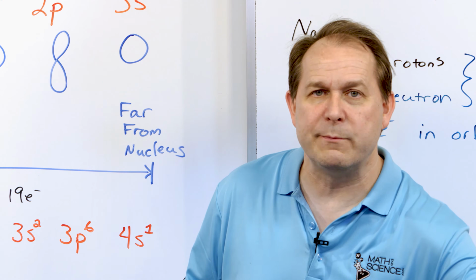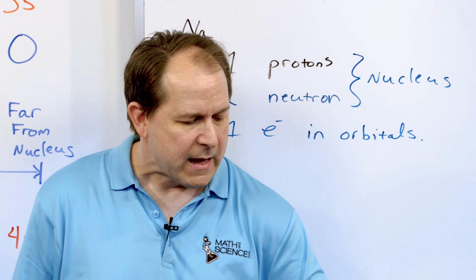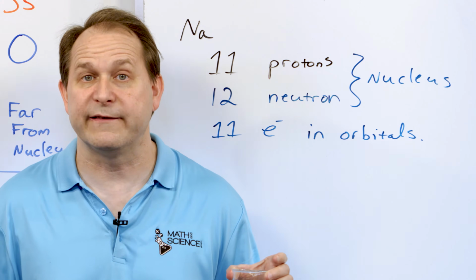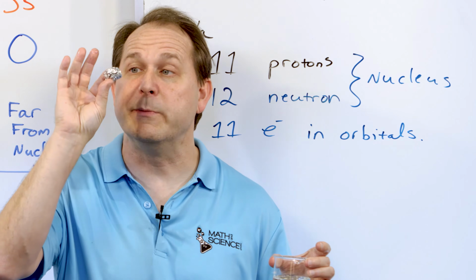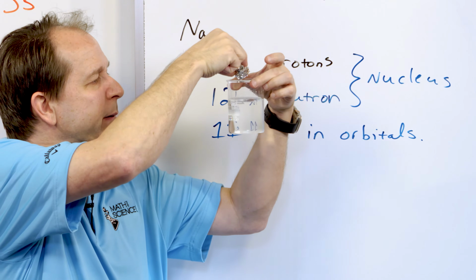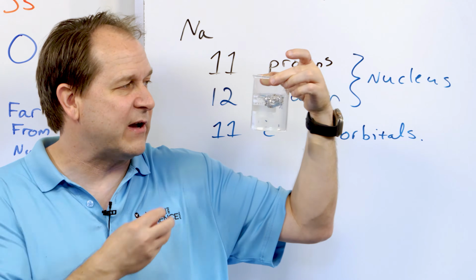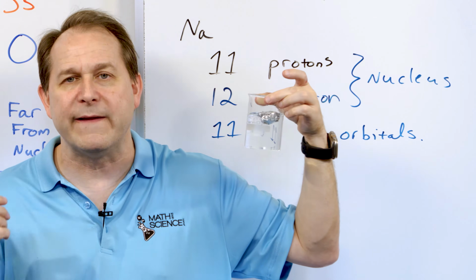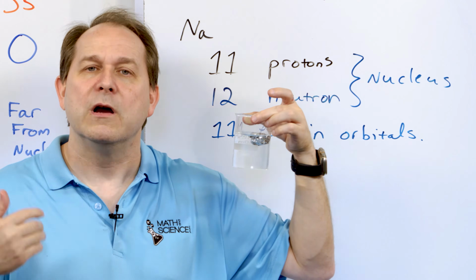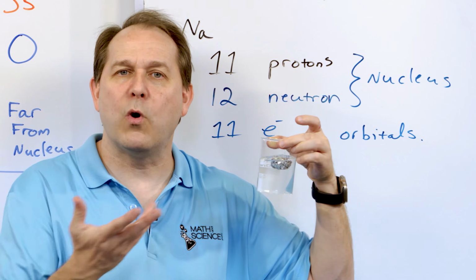Now, as you look at the slow motion video, I want to call your attention to this beaker of ordinary water. I want you to have this concept in your mind as we look at the slow motion video. This is aluminum foil. It's aluminum metal. If I take this liquid water and drop the aluminum foil in, absolutely nothing happens. Of course, the aluminum floats on the surface because I've got it in the proper shape for the buoyancy, but no chemical reaction is happening. Aluminum is a metal. Copper, if I put it in there, nothing will happen. Nickel, iron, I put it in water, nothing happens.